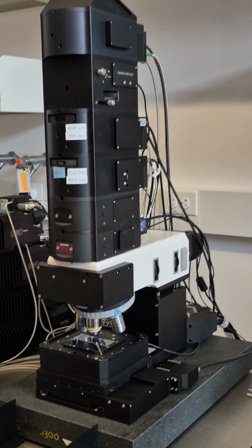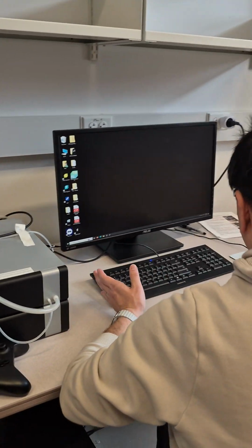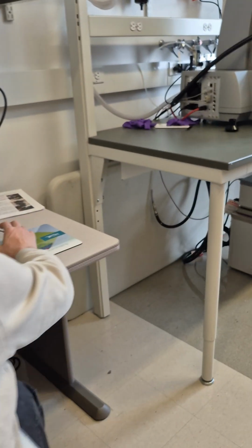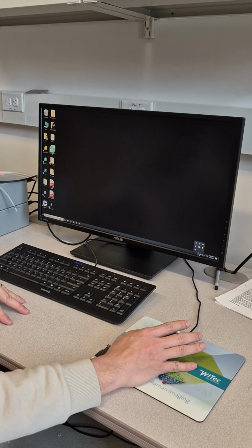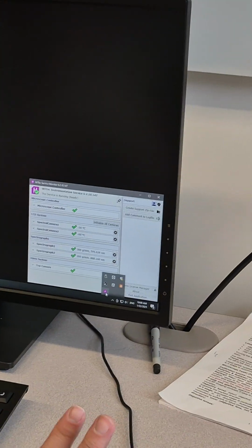Right. Okay. Got it. Okay, so now we turn on the computer, it's already maybe 5 minutes already. So while we are waiting, you need to come here. So in the quick load place, we have a server, which is this one, the purple with the H. This is the server. You click on that, it shows you the status of the server.